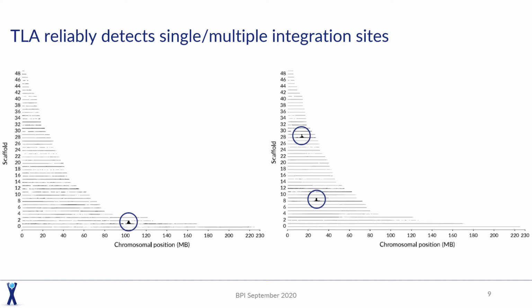So one of the key advantages is that we can, in a single go, like for example with FISH, show where your transgene is integrated. So here you see genome-wide coverage plots. Of course, with CHO, we don't work with chromosomes, but with scaffolds. So here you see you have a single or multiple integration sites immediately being depicted in respectively the left and right panel.